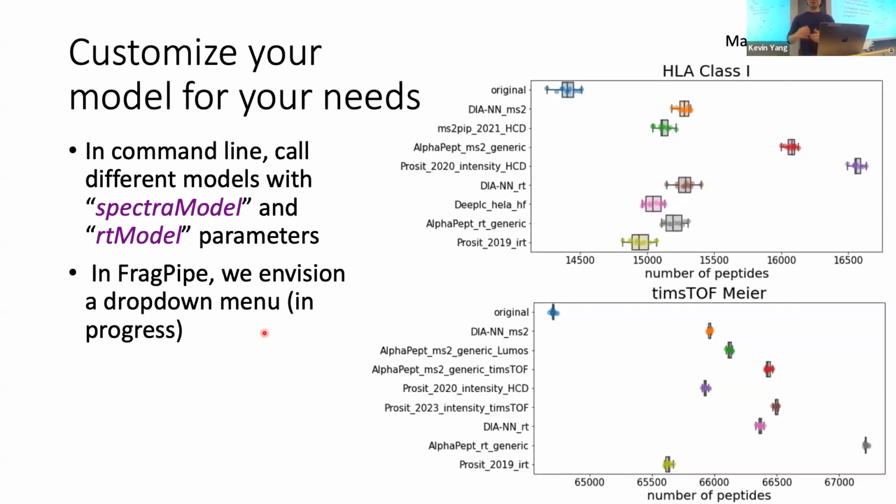But that being said, you don't want to go on a wild goose chase. Sometimes the spectra itself is just so messy, it's hard to actually see that any peptide generated anything in there. And so we don't try to rescue those because those are unsavable.